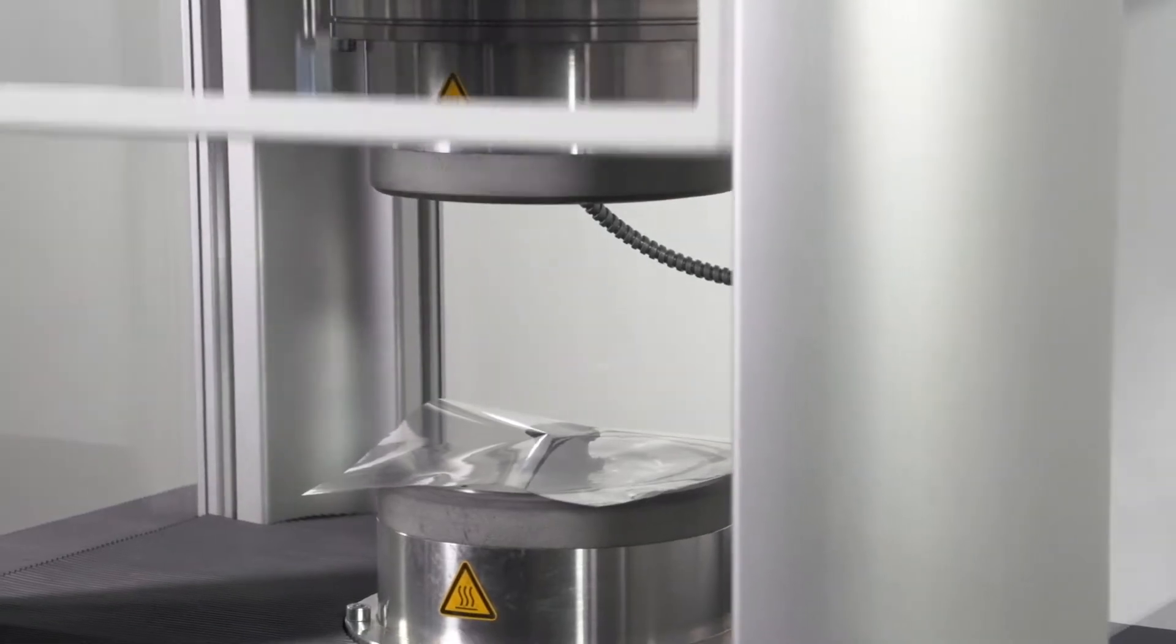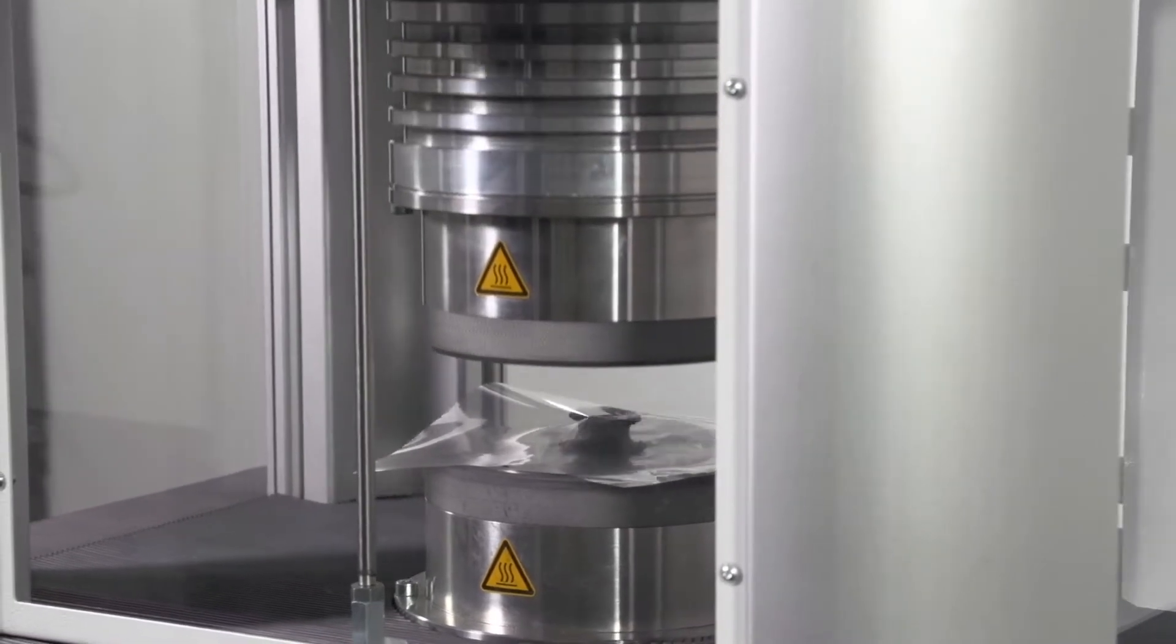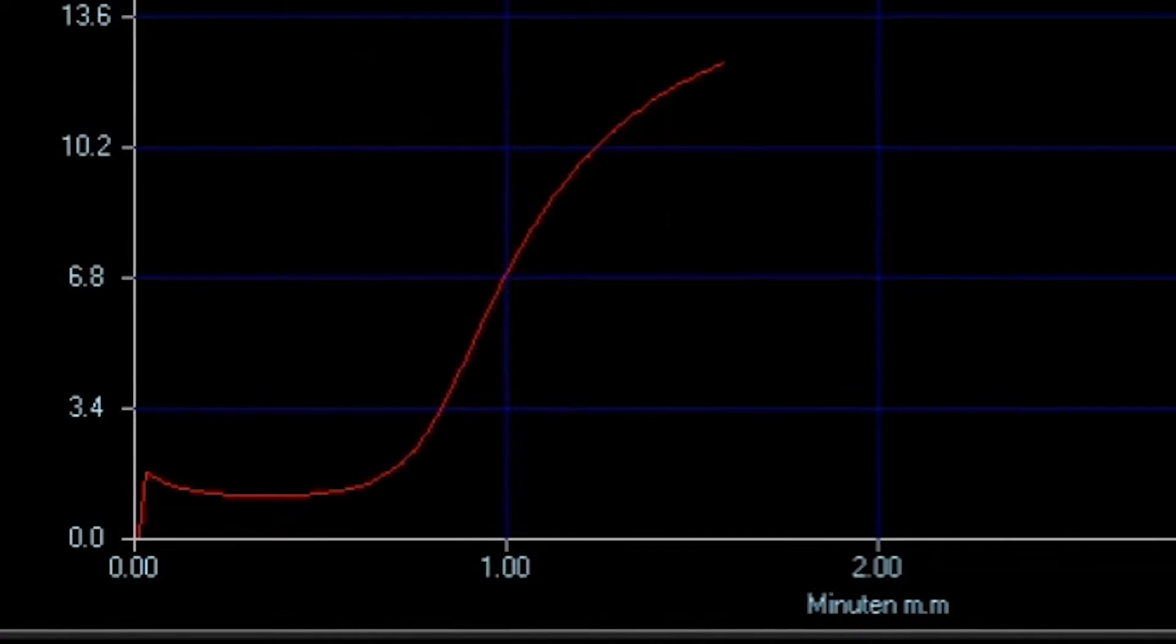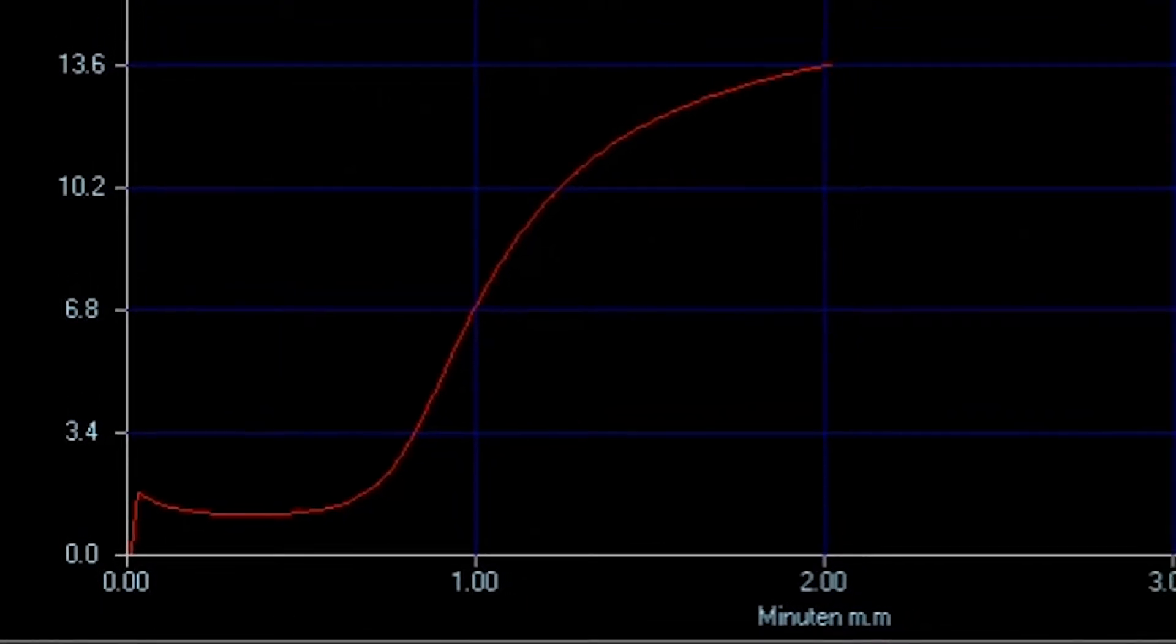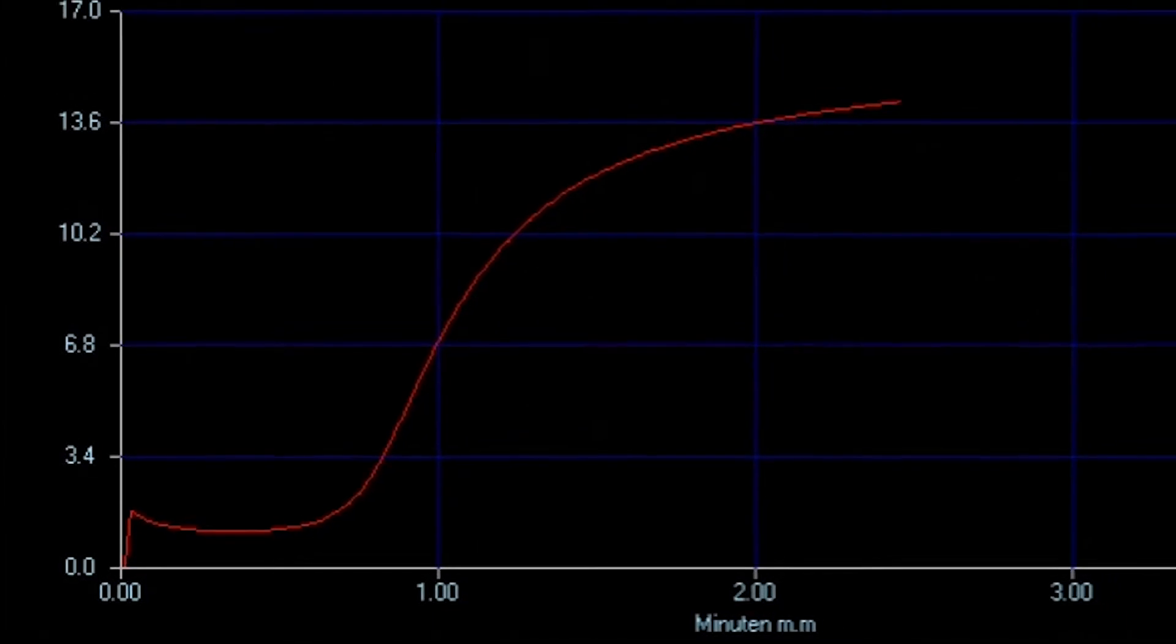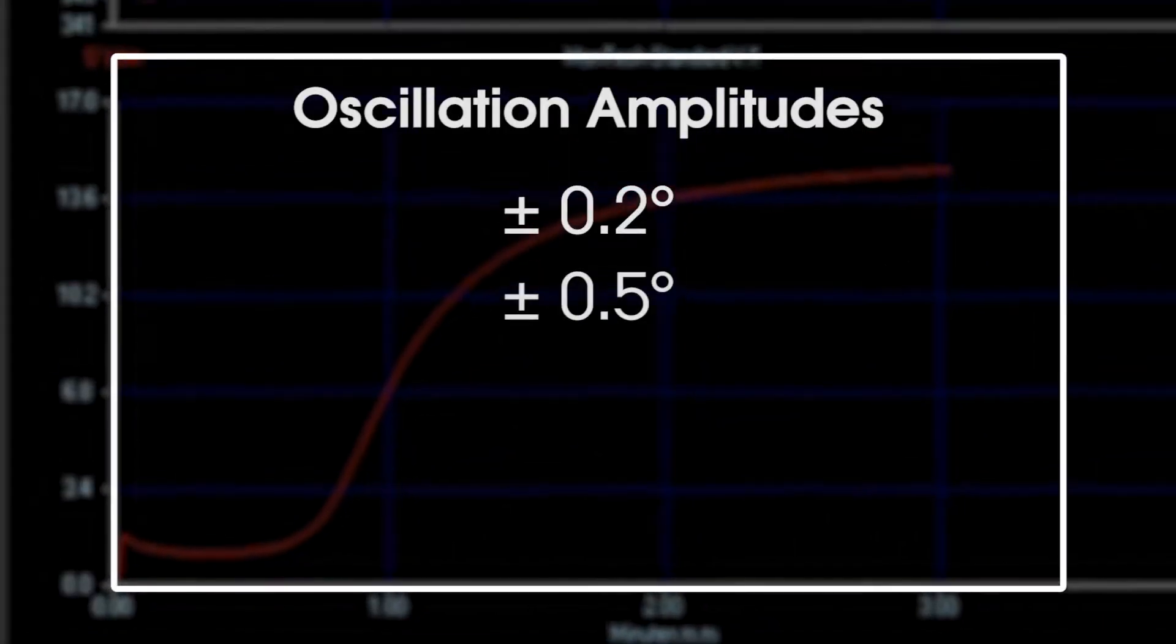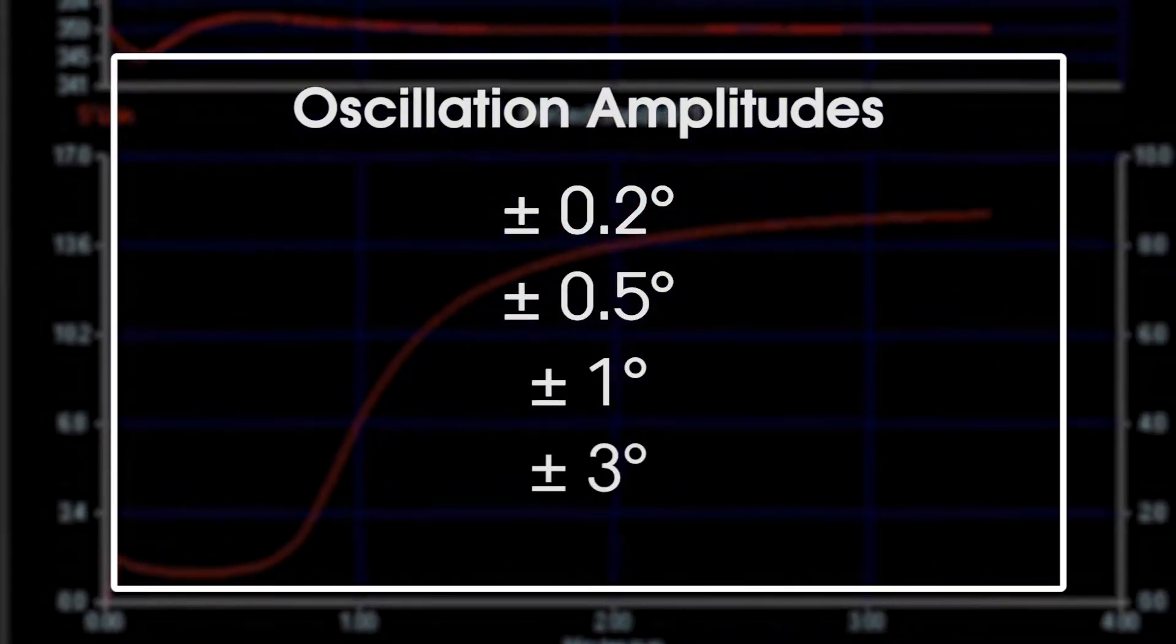The test chamber of the MDR3000 Basic is equipped with a pneumatic closing cylinder with a closing force of 11.6 kN. Using a mechanically fixed amplitude and oscillation, the samples are torsion tested. Oscillation amplitude can be manually adjusted to plus or minus 0.2 degrees, 0.5 degrees, 1 degree, or 3 degrees.